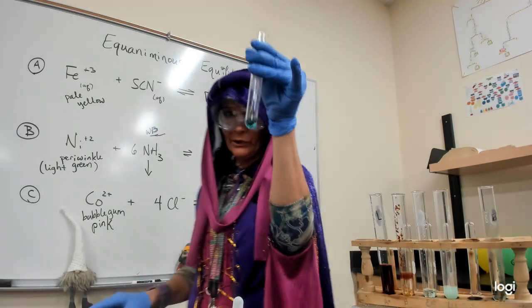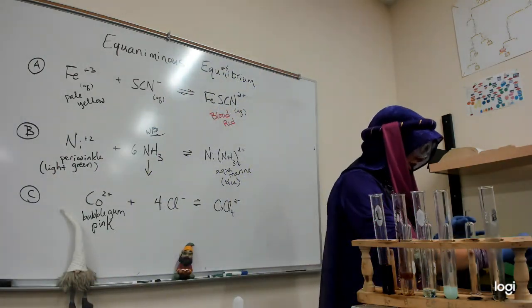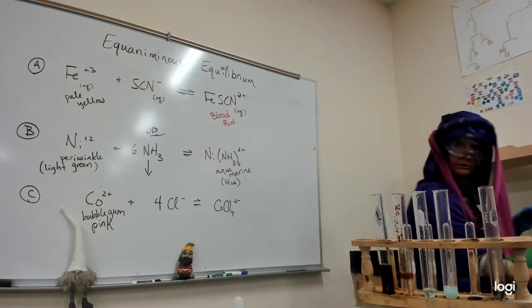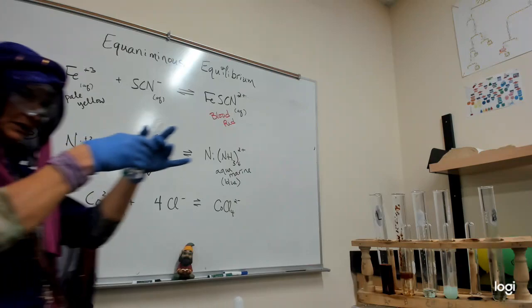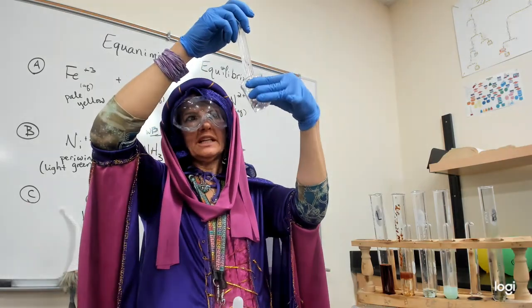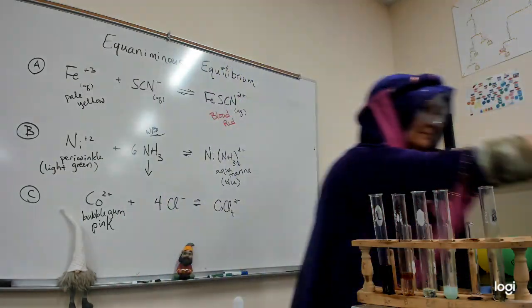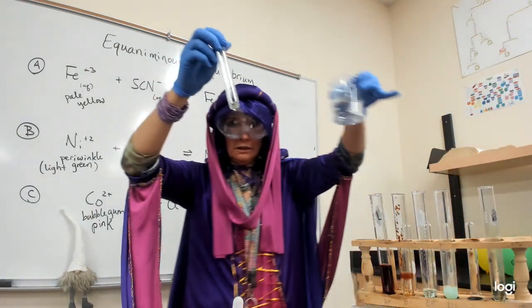This beautiful blue color. And then if we put it in some warm water, cool water, room temperature water, let's turn this off. Help to cool it down. We should be able to get it back to the pink. Maybe. Oh, actually, you know what? I didn't want to get it back to the pink yet. Let's get back to the hot. Do you want to watch that again? Because it was really cool watching it in slow motion.